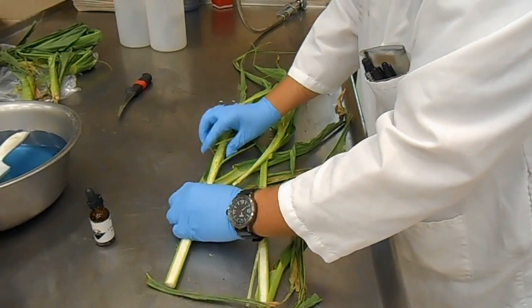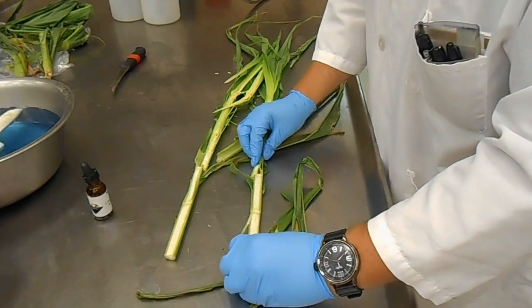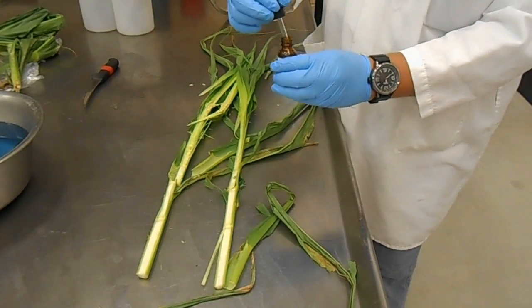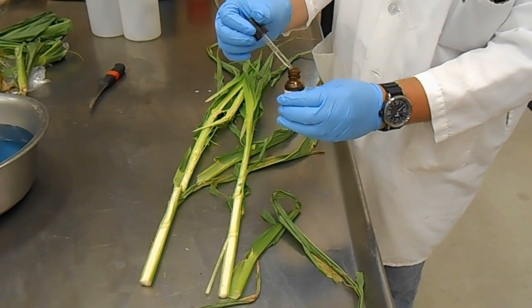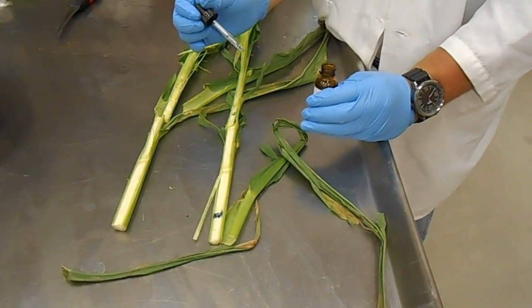When you have the stock separated out, go ahead and put the diphenylamine solution on the stock. Start about six inches up from the ground and then every six inches after that. A deep purple color change indicates a positive nitrate test.